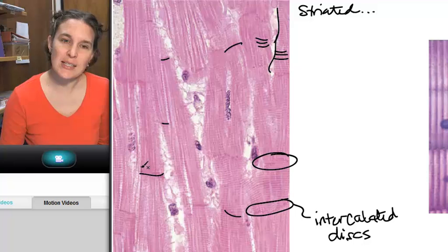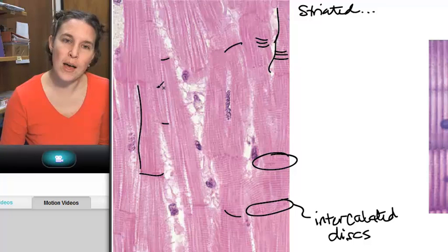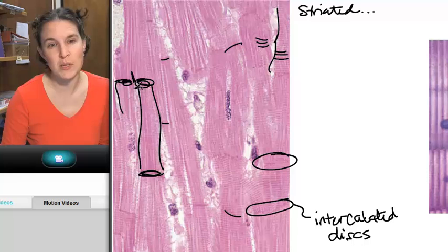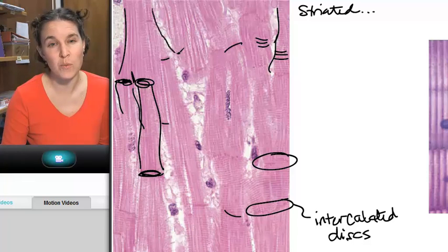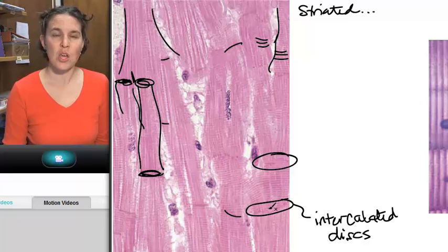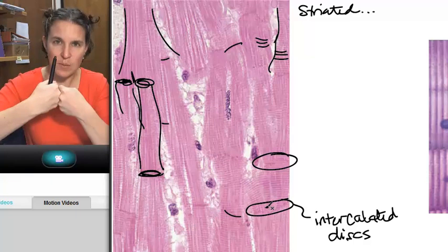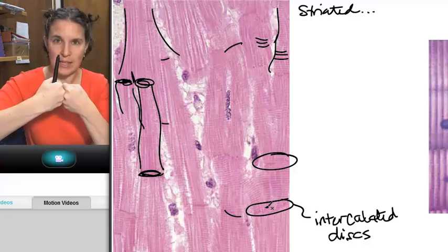Intercalated discs are these unique structures that connect two cardiac muscle cells to each other. At an intercalated disc, this would be one cardiac muscle cell. Here's an intercalated disc, which means that this is another one. Here's another intercalated disc, which means this is another one. Intercalated discs connect cardiac muscle cells end to end.